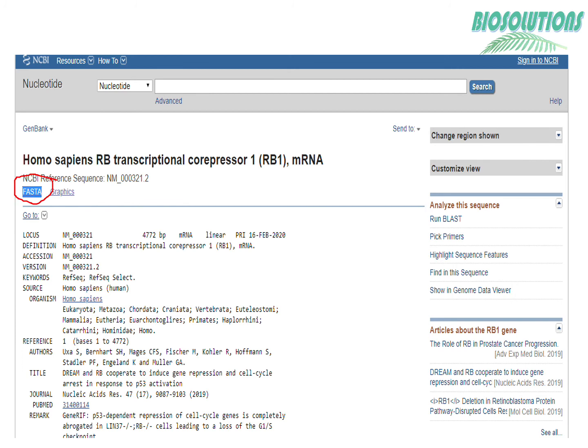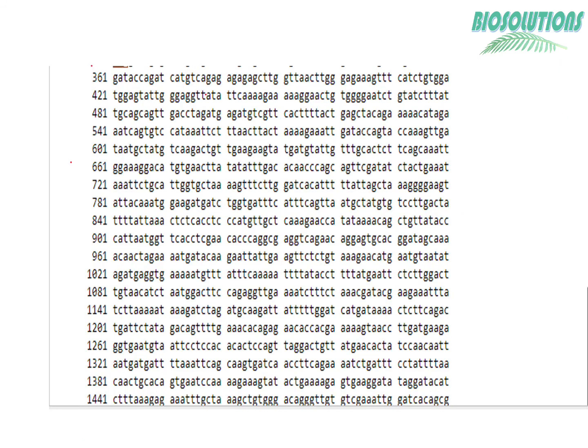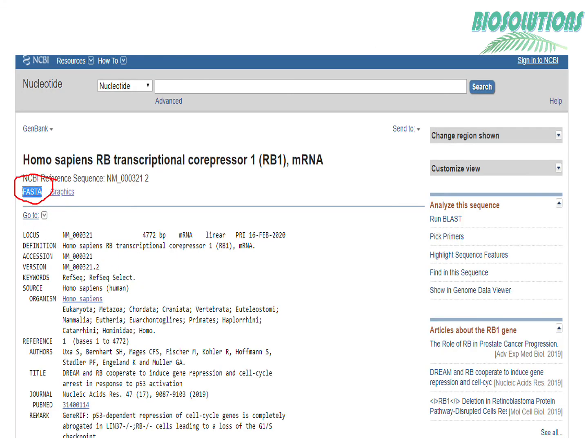Finally, we want the sequence to be used for various purposes like BLAST or Clustal W software analysis or any other software analysis. The given sequence here is in GenBank format, which has spaces and numbers. Most softwares or tools will not accept this format, hence we need to get the sequence in FASTA format. This is also indicated at the beginning of the annotations. FASTA is an abbreviation for fast algorithm. FASTA formats are used for nucleotide as well as for the protein sequences using single letter codes.